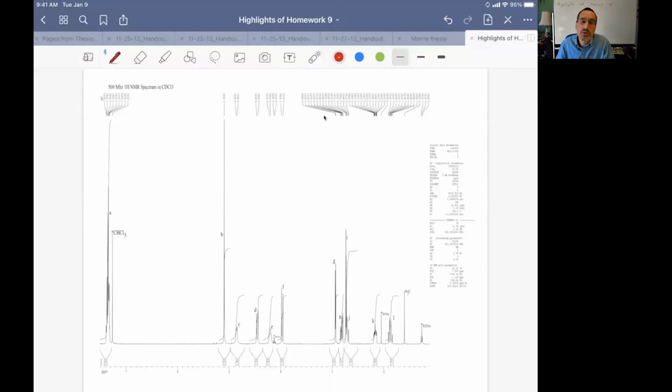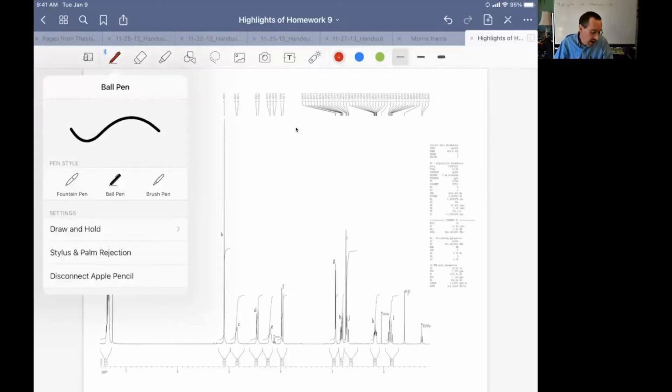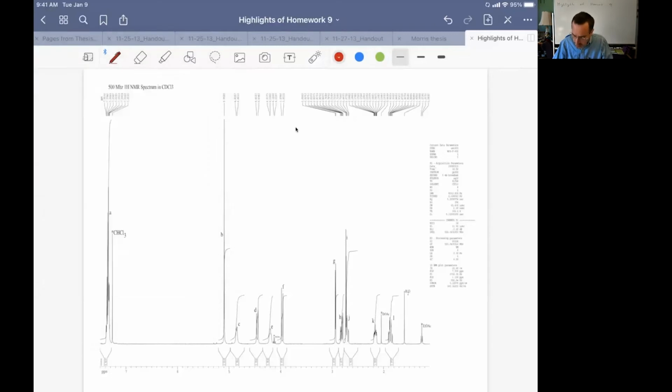And so I want to show you some of the highlights of this lovely molecule. In this molecule, one of the things I'll highlight, and one of the problems we're going to have for solving the structure, is that we have an isolated methylene group. And actually, we have 2 isolated methylene groups in the molecule. And you've already seen we had a problem.